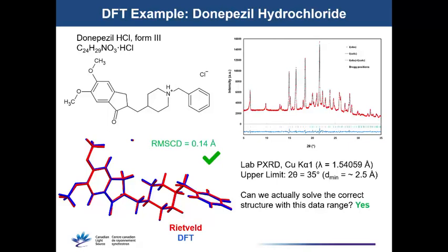Which one do you trust more? At that point, the difference isn't enough to really make a call, they're similar enough. There's no main chemical feature that looks different particularly. You've got the same geometries, and there are slight discrepancies in bonds and positions. The hydrogens might not look quite as good because the hydrogens weren't refined with the PXRD.